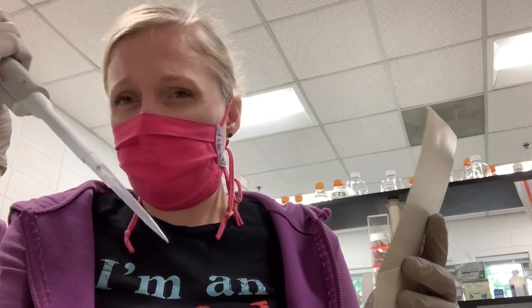The other thing I didn't explicitly say was that I was using a new tip every time I went into the DNA binding buffer. You don't want to be pipetting DNA and then go into the binding buffer. Then it'll all get mixed up and contaminated. So you need to use a fresh tip each time you go into the binding buffer.